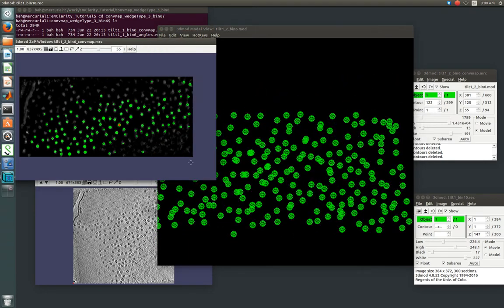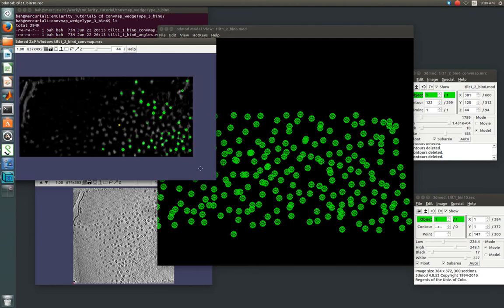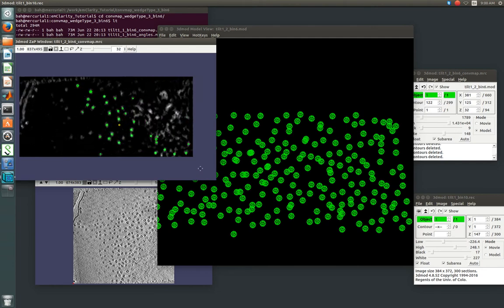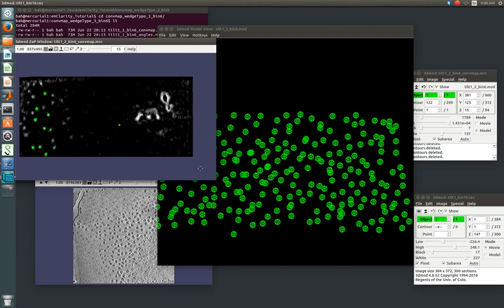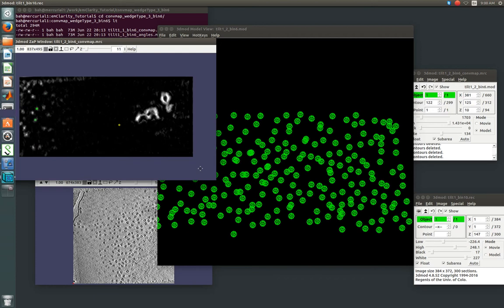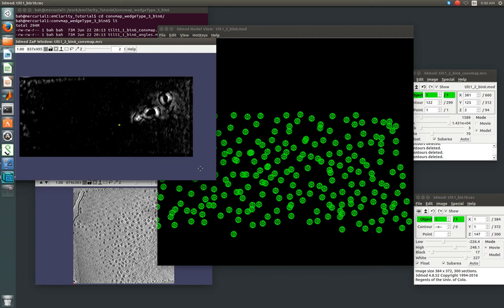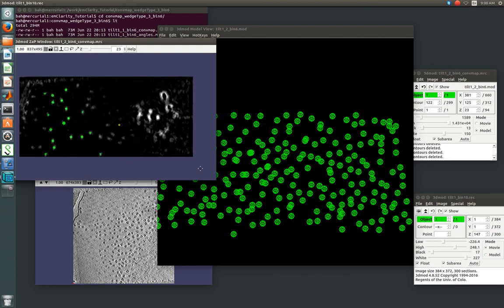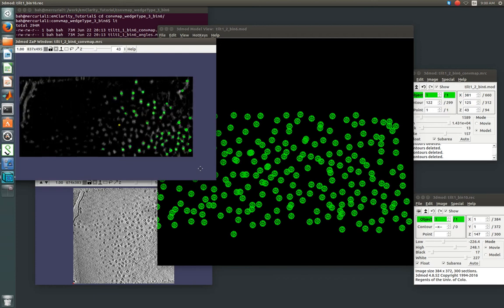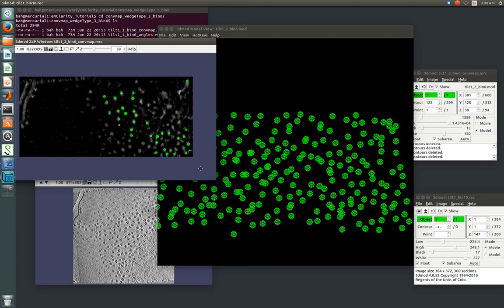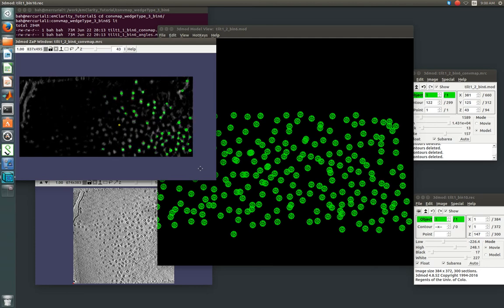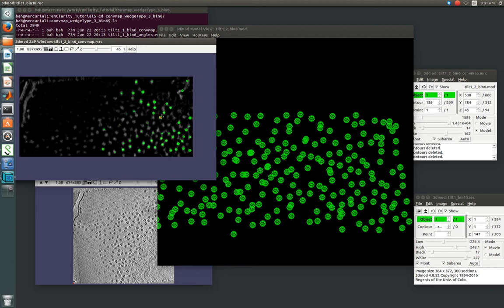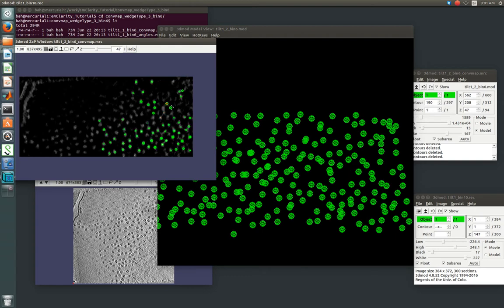Okay, so this model looks pretty clean. I'm going to take one more look through the cumulative convolution map. And it looks like we did get rid of all that junk. You can see the bright hits over here on the right. I'm going to say that these couple points here are probably still junk too. You see how this has this diffuse density? And same here. So I'm just going to right click on those and shift D to delete.